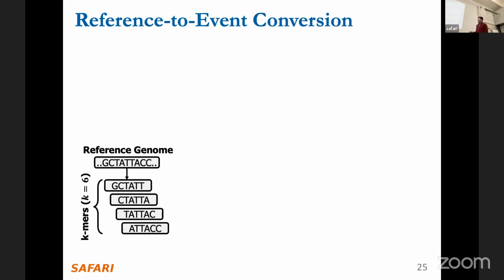The size of this k-mer is crucial because we determine it based on the nanopore model that we are using at the moment, because we know on average how many k-mers will exist inside a nanopore at a time. If this number is 6, we extract 6-mers from a reference genome.